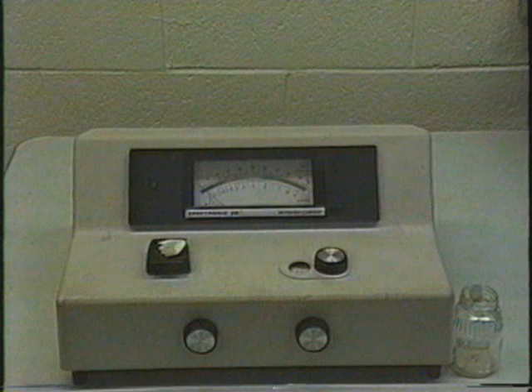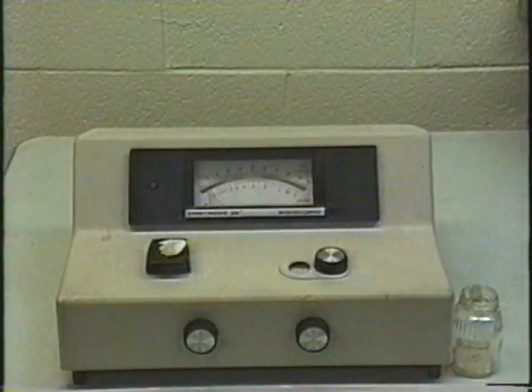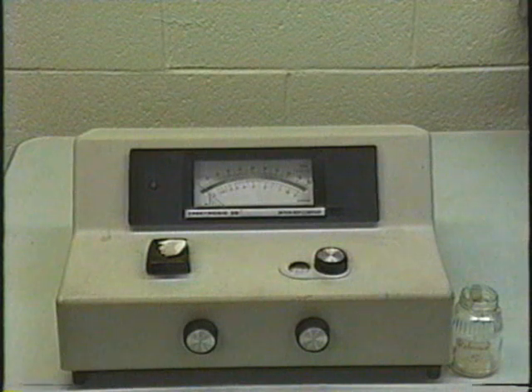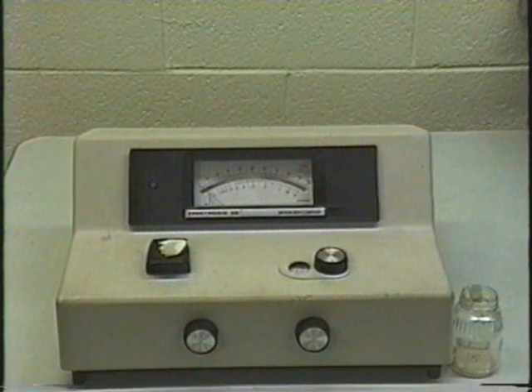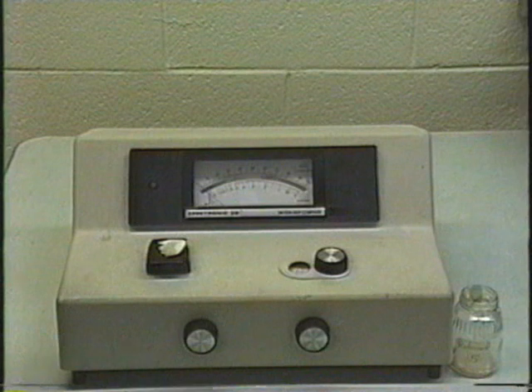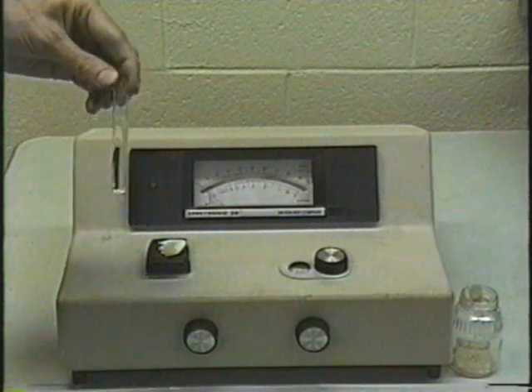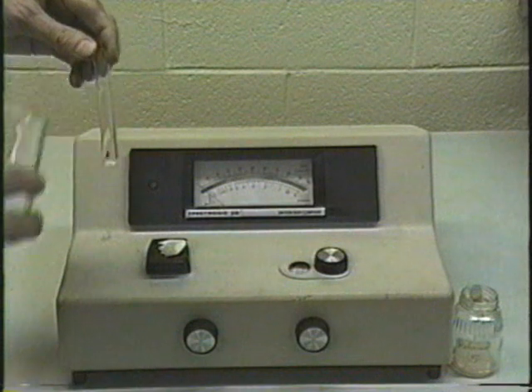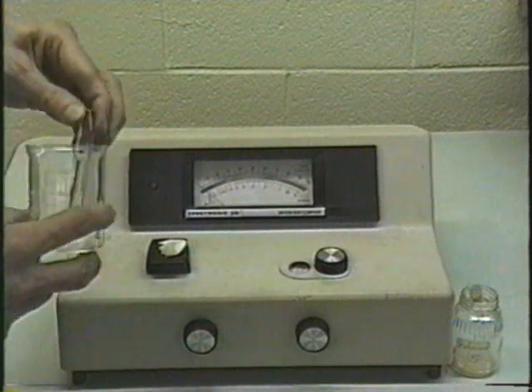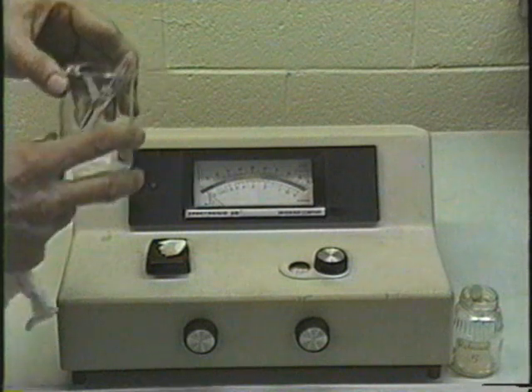All right, here we are at the spectrometer. Now, you're going to make several solutions today, 2 from your standards and 1 each from your unknowns, and you're going to measure them in this spectrometer. You will bring these solutions to the spectrometer, and when you do so, the solution should be in a cuvette. This is a cuvette here, and it has the blank in it, and you should carry this in a beaker so that you don't get fingerprints on it.